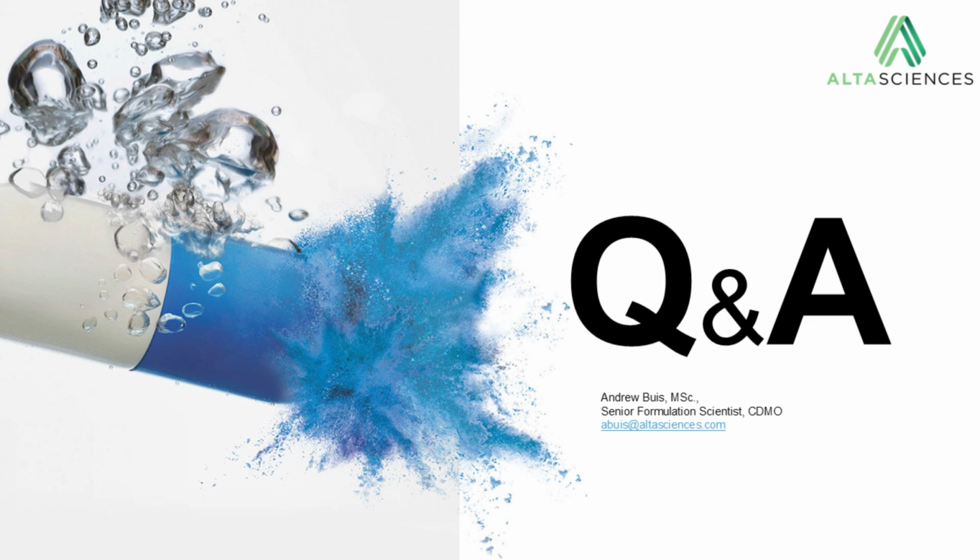Okay. And the final one we'll take right now is, how small can nanomilling take an API down? Well, that's a great question. That's one that we're asked very often, and the answer is it depends on the API itself. The friability, or fracturability, of those API crystals, which can depend on the crystalline form as well as other salt forms of those drugs, is the most likely determining factor, given that particles can be nanomilled and have been nanomilled, generally easily, to between 100 and 200 nanometers, and sometimes even lower. Well, I've seen some down to 50 nanometers for certain drugs.